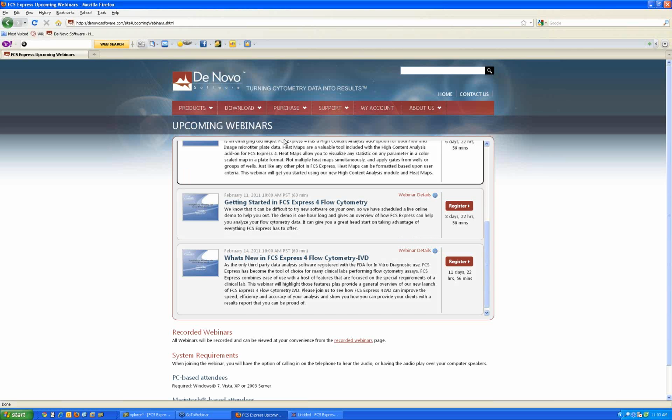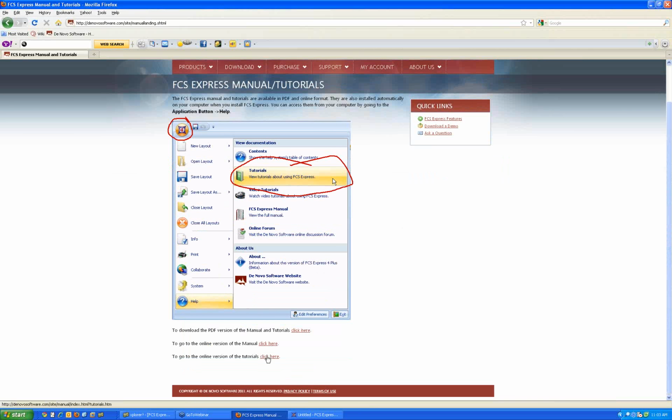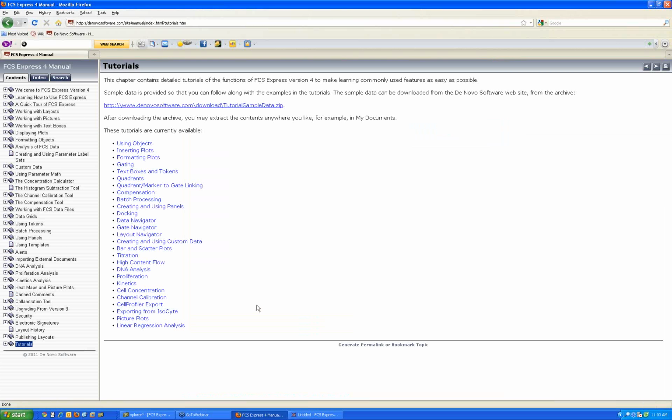So there's that. On our website, and with every copy of FCS Express, inside FCS Express, you can get the tutorials by going to the application button and then tutorials. The tutorials and manual are now both online in this version. You can just click at the bottom of this page here, and it will take you to our tutorials, and you can see that we have a whole bunch of tutorials as well.